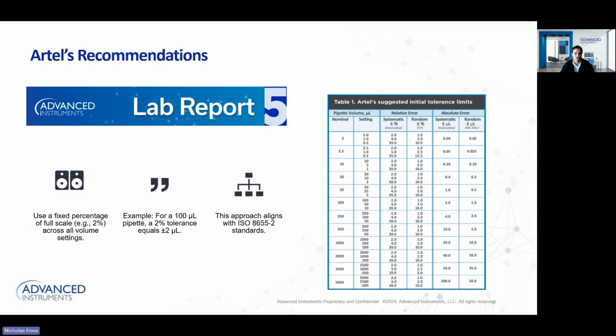This really is, I think, a really good way of starting with your tolerances that most lab operators could actually hit, and also are really informed when it comes to actually setting standards in general. Questions on any of that? Just want to stop real quick, level set, give everyone a minute if there's any questions on Lab Report 5. Candy has that in there for you to download, but it's a great area to start with. This is specifically for pipettes, but these same tolerances could be applied to your liquid handlers too.